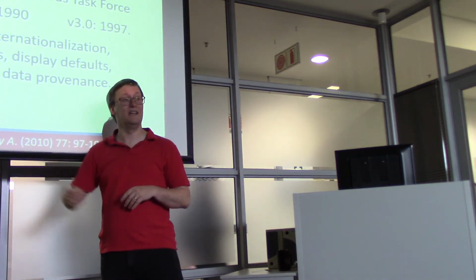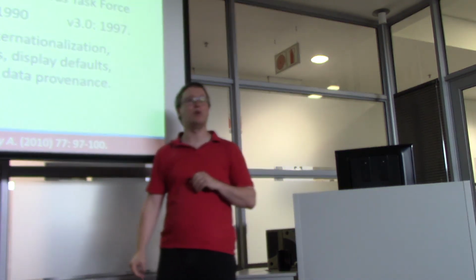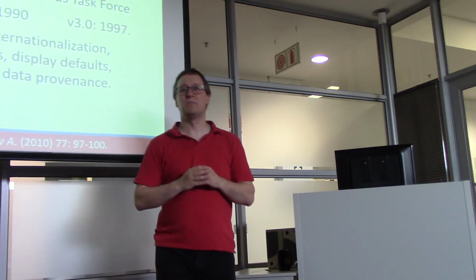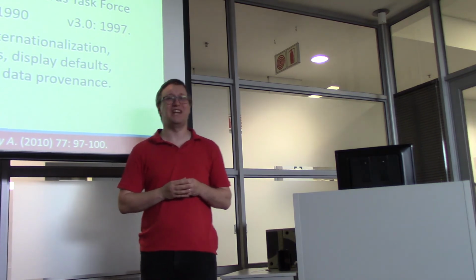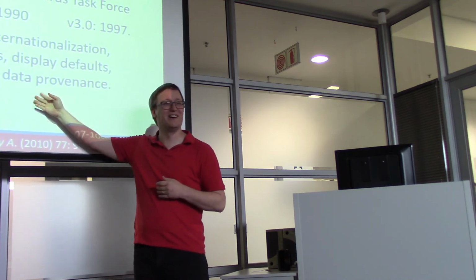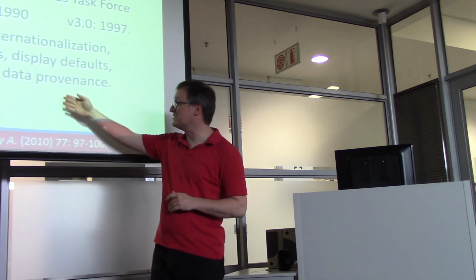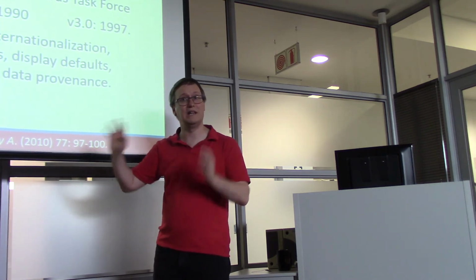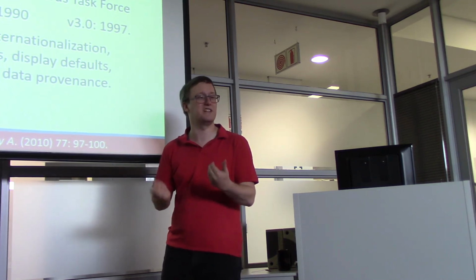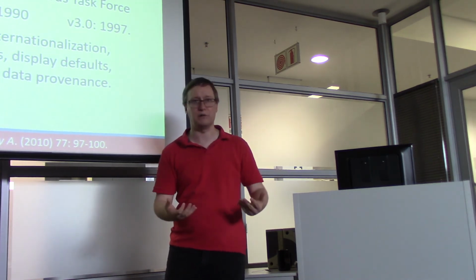Metadata, remember metadata? If you'd like to store what part of the experiment this particular file relates to. What about data provenance? Provenance. It's a lovely word, isn't it? Provenance describes how you got it. Kind of the chain of custody is another way to think about it. What did the sample go through to get us to here? How have you analyzed the data over time and written those results back to FCS? So this is a really great format. It's had a lot of time to grow, and these files kind of act as the standard arbiter of flow cytometer information that enters into software like FlowJo or the flowCore libraries in R.